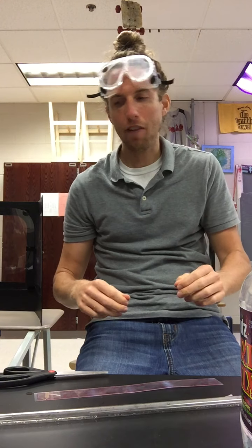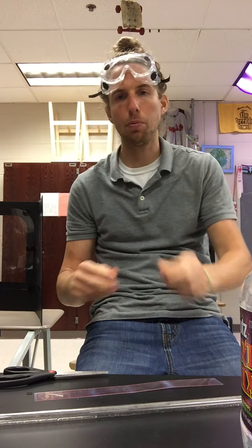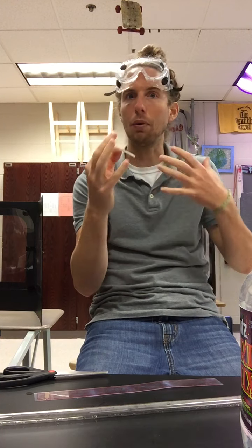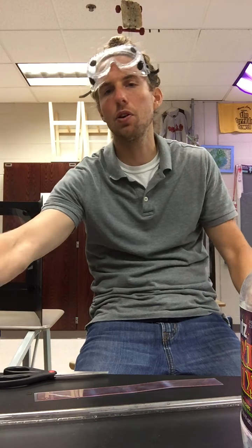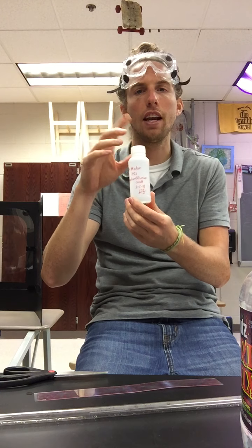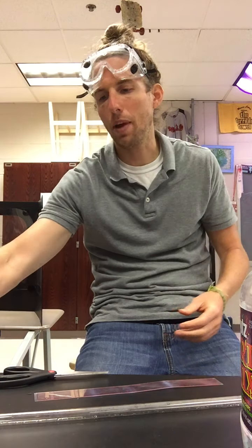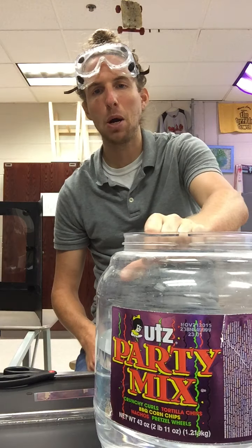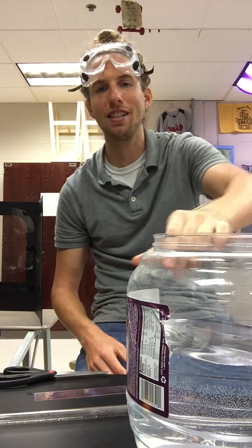So, I have myself a long strip of magnesium. This isn't that long, and we're going to use magnesium as one of the reactants in our chemical reaction today. The other thing we're going to use is 4 molar hydrochloric acid, HCl, 4 molar. And then we have a big tub over here that used to be some party mix. It's now just a big tub of water.